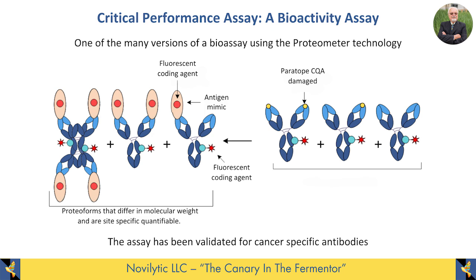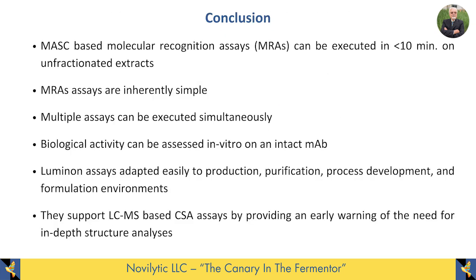And so what it means is in manufacturing and all kinds of things, you can do very quick things that give you an early warning that a molecule is active, it's not active, and in fact, if it's not active, the percentage of the whole thing that does or does not work. Now going to the conclusions, that this kind of molecular recognition assay can be done in 10 minutes. And we can find out all kinds of features about the molecule, but the most important one in molecular recognition was whether the molecule works or not.